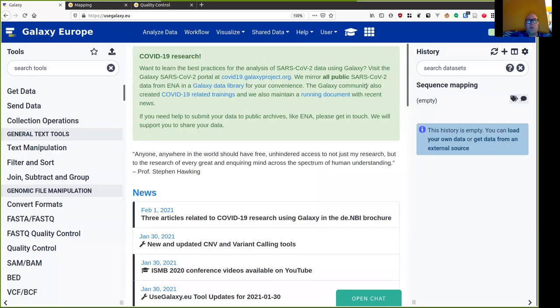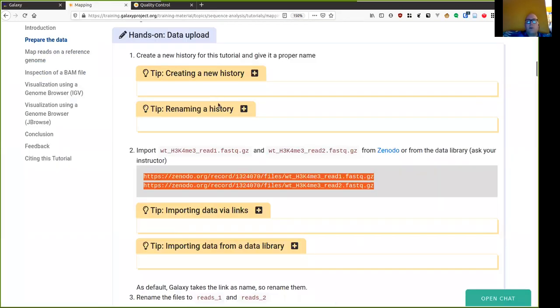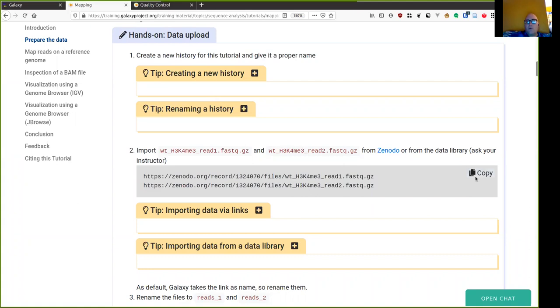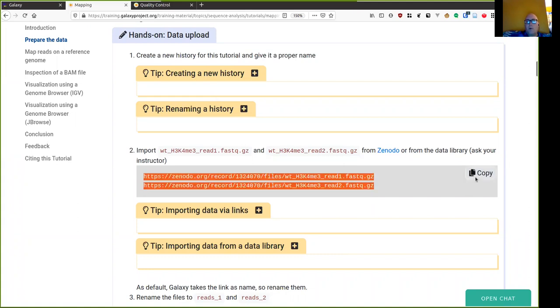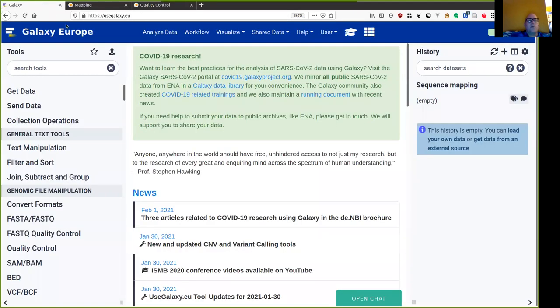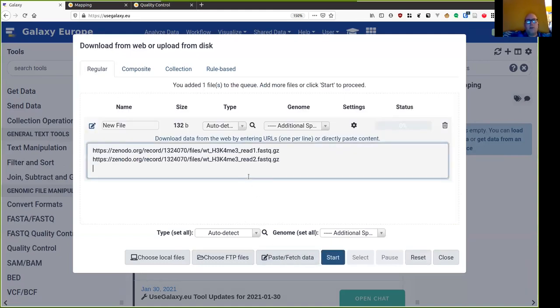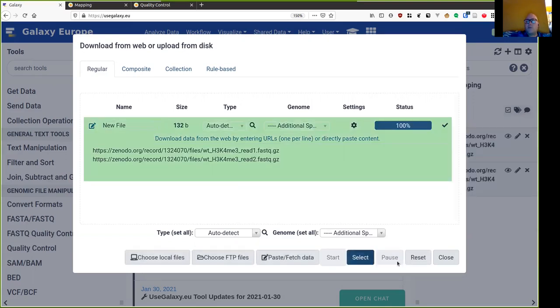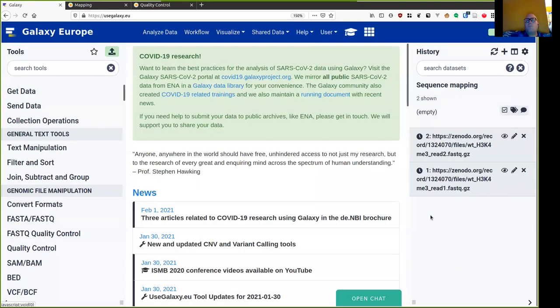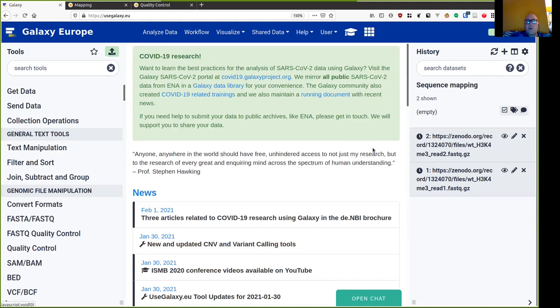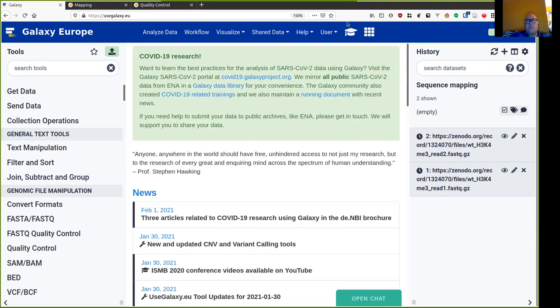This tutorial uses some data provided on the Zenodo service, so I've collected the links to that data from the tutorial, which you can see here. You can just go to the tutorial and copy the links, and I'm going to load that into Galaxy. I'm going to paste fetch data and start. This current data is quite small, because we're just using it for the tutorial, and we're not doing a real analysis.